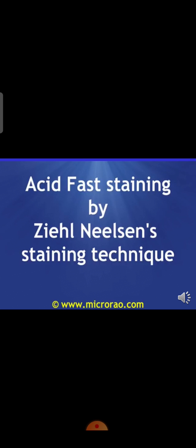So the application of the carbol fuchsin is for 5 minutes. For the first 2 minutes we heat the slide from underneath using an alcohol burner. After we finish the 2 minutes of heating the slide from underneath, we let the slide cool for the remaining 5 minutes.